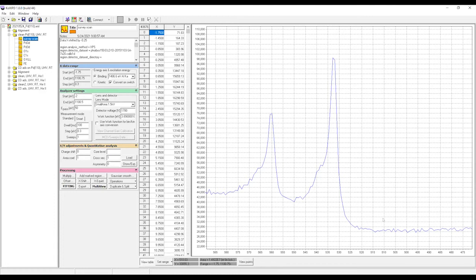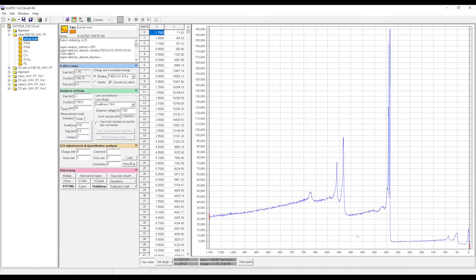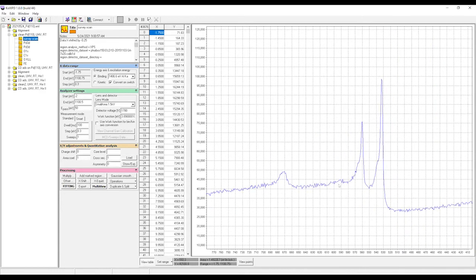And the third one is a Tougaard. Tougaard background, you probably know. You preferably have to incorporate more space in between the spectrum itself, and based on that you can also calculate the shape of different heterostructures on your surface, and it's quite useful. But honestly, we are mainly dealing with the Shirley background. Once in a while, we have to use the linear, and it's enough.